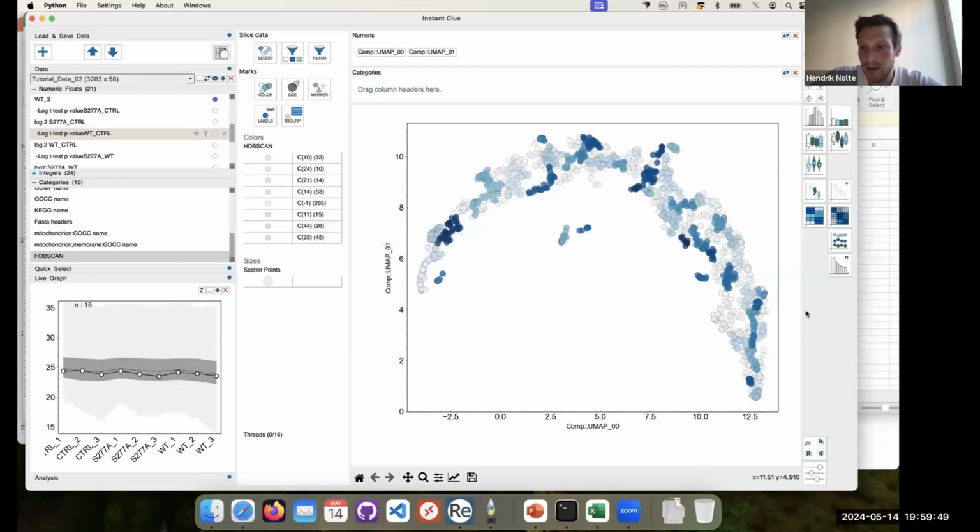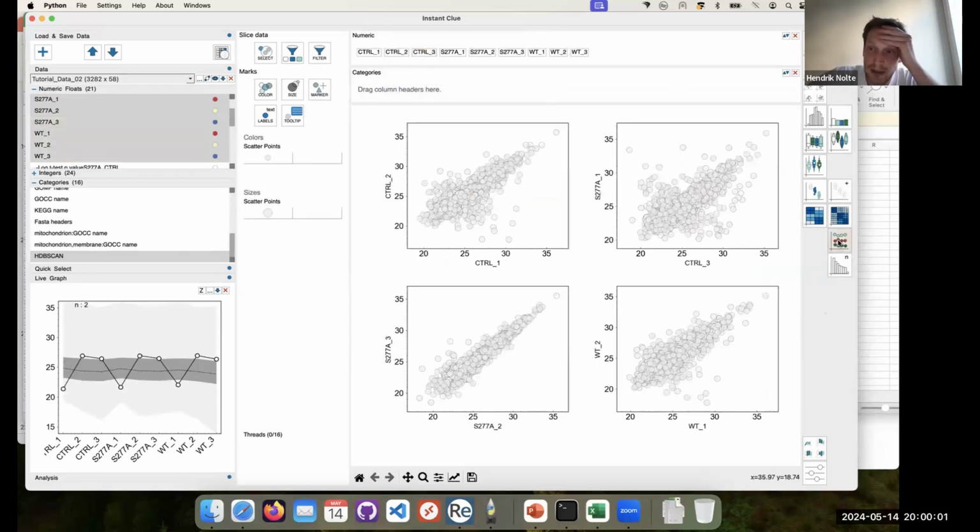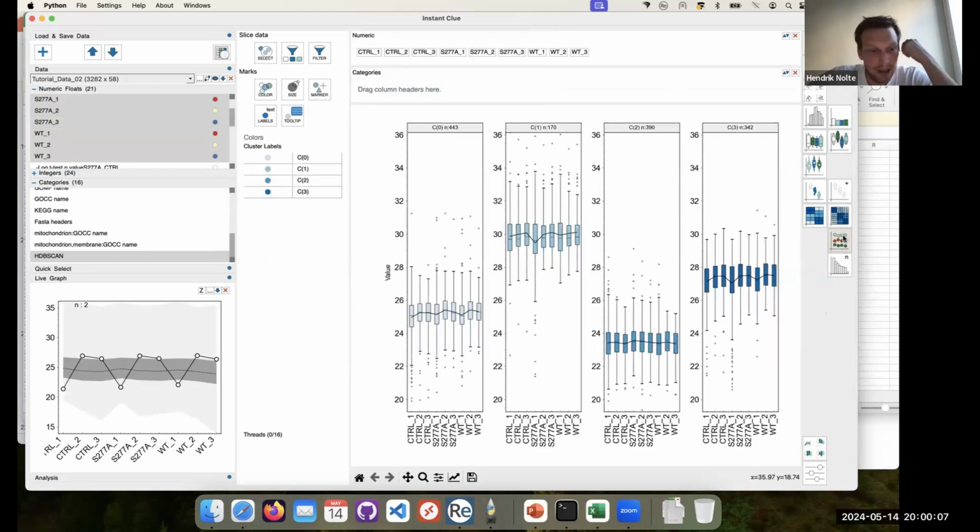It's my recommendation. What may be useful for some of you is the k-means clustering. Please, again, I refer to the internet for literature on the theory behind that. But I just want to mention that for k-means clustering we have a convenient one-click solution. So you just click on it. You can define the number of clusters here in this widget, and it allows you to cluster the proteins. Again, you would use that on a set of significant proteins or something like this. But since this is more general data visualization, I wanted to show you more different plot types.